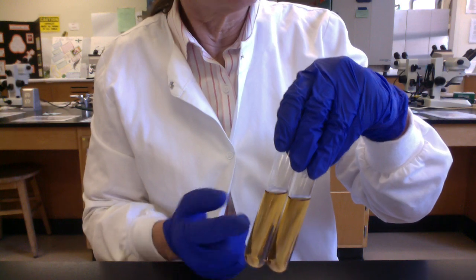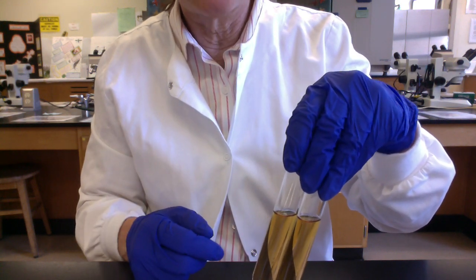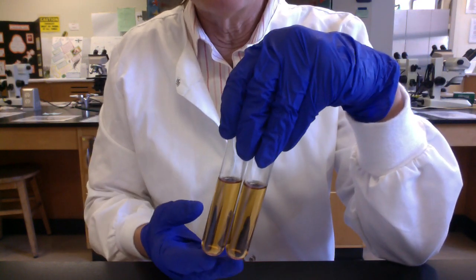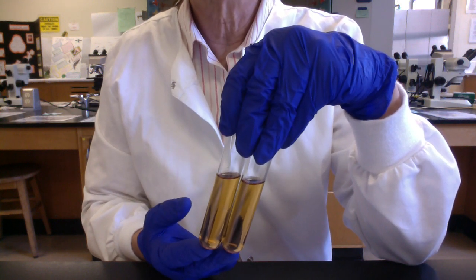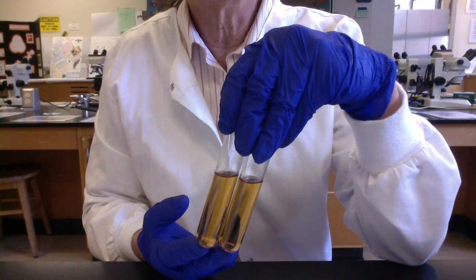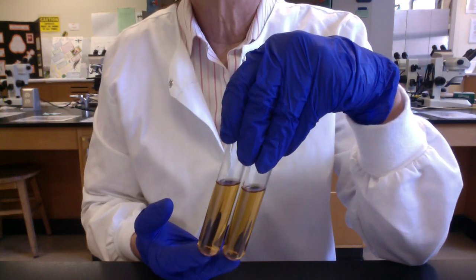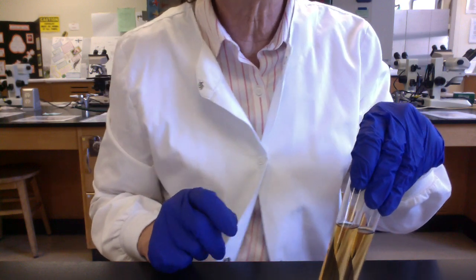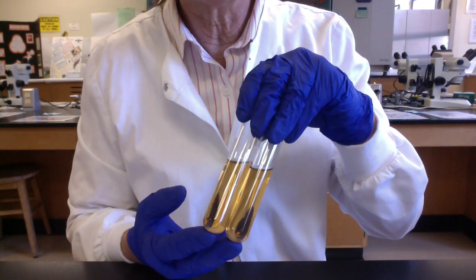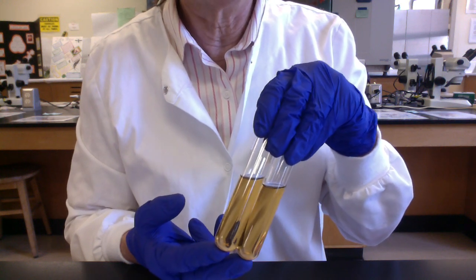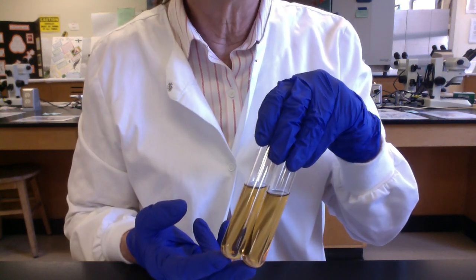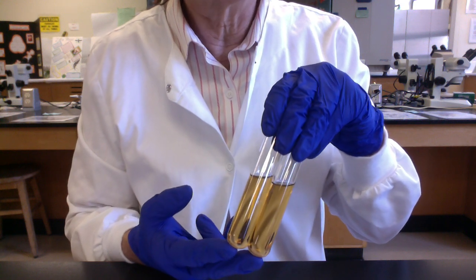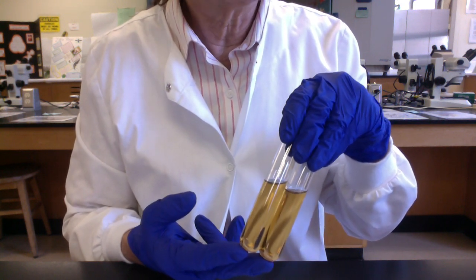A disadvantage of broth, and we'll follow up with this, we'll do some inoculations and incubate them and come back this weekend and take photos. A problem with broth is that if cells are present, the broth will appear cloudy or turbid. But we can't tell just by looking at the broth if the culture is pure, meaning a single type of microbe present. In diagnostic microbiology and in doing antibiotic sensitivity testing, it's really important we have pure cultures, otherwise our test results will be meaningless. So with broth cultures you can't guarantee that your culture is pure, you just know that cells are present. This was the disadvantage that Louis Pasteur's lab had when they were trying to prove the germ theory of disease. All they had to work with were liquid cultures, broth cultures, and therefore they could never guarantee they had a pure culture.